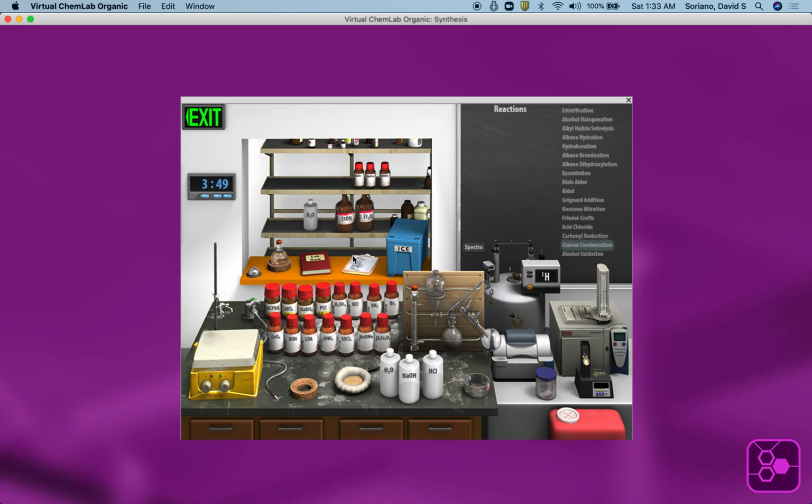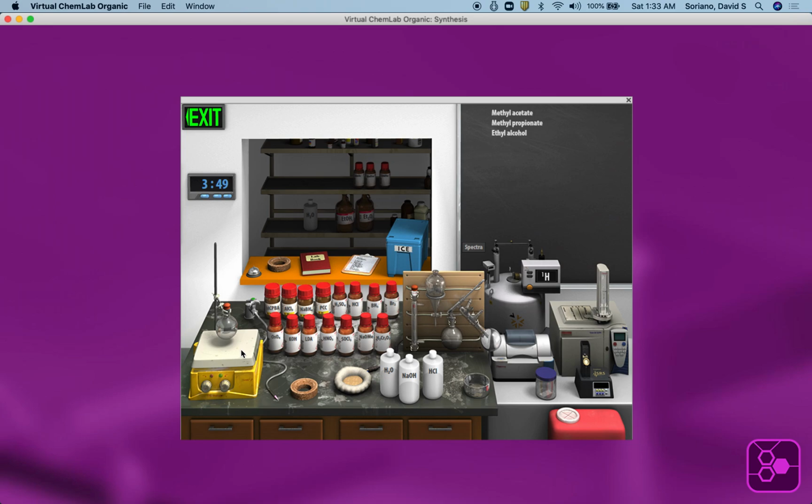Now let's put a solvent in there, ethanol. And you can see there are the three components. Bring it down to the stir plate. I'm going to need a catalyst. So I am going to offer it sodium methoxide. Double click, and make sure we get that in there. Okay, there are the components and sodium methoxide catalyst, a base catalyzed Claisen condensation.